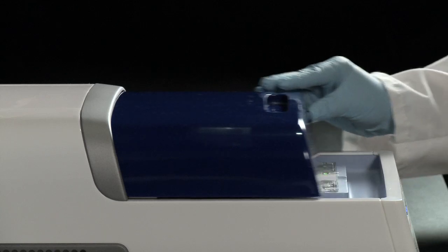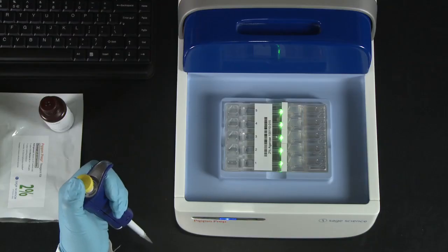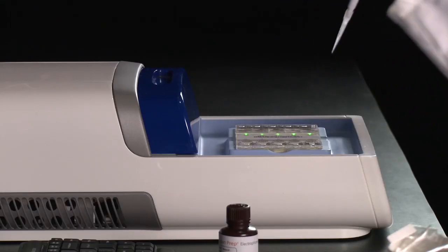Open the lid. Remove 40 microliters of buffer from each of the five sample wells. Close and discard.